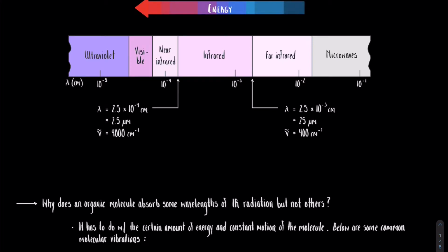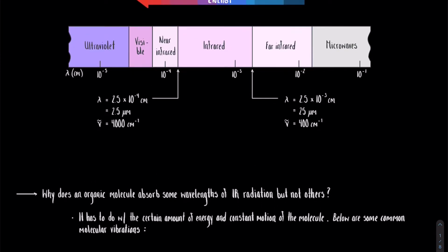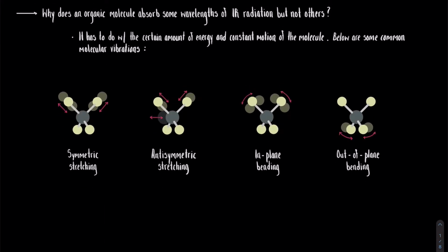So when an organic compound is exposed to a beam of electromagnetic radiation, it absorbs the energy of some wavelengths, but it passes or transmits energy of other wavelengths. If we irradiate the sample of a specific organic compound with different wavelengths and then determine which are absorbed and which are transmitted, we gain what is called an absorption spectrum of the compound. The energy a molecule gains when it absorbs this radiation must be distributed throughout the molecule. With infrared radiation, the absorbed energy causes the bonds to stretch and bend extremely vigorously.